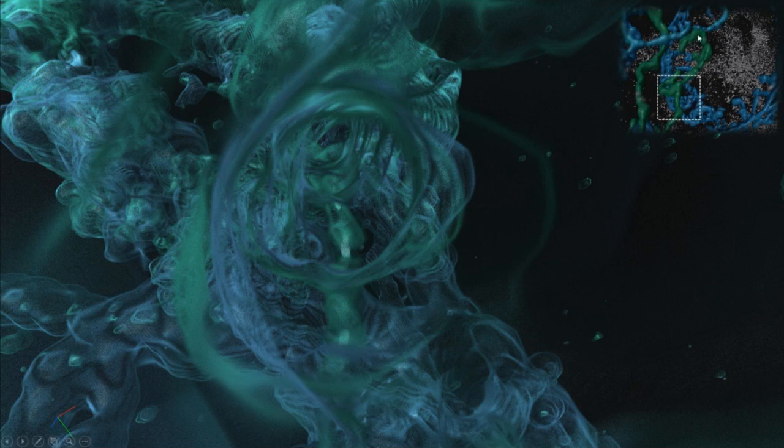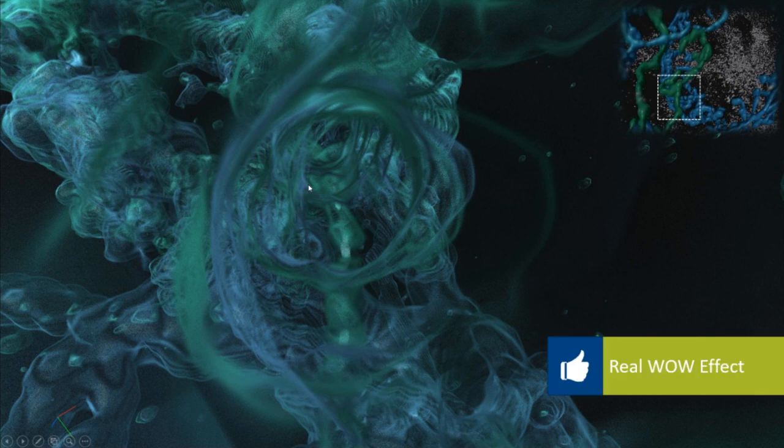And then with the visualization techniques, we can do things like really open up an image. In this case, we have some neurons labeled with a fluorescent dye, and they have a solid appearance. But using some direct volume rendering tricks, we can render the raw data in a way that really opens the image and enables us to go inside of it and explore it and really begin to see and feel the three-dimensional relationships between the objects.